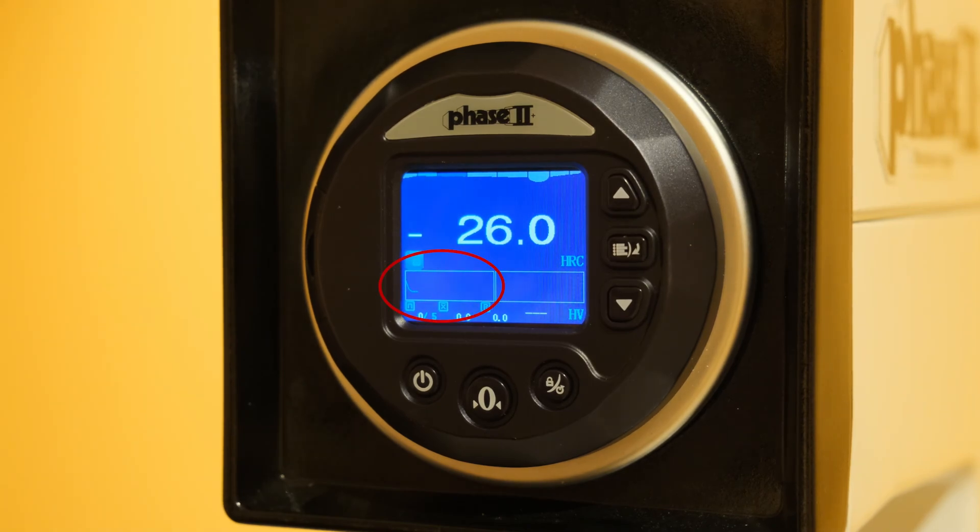A graph at the bottom of the indicator plots the difference in the height of the penetrator. Once the line stops its rapid descent and begins to produce a straight line, begin your count of five to seven seconds. After said time has elapsed, unload the sample using the load-unload lever and the results will be displayed on screen.